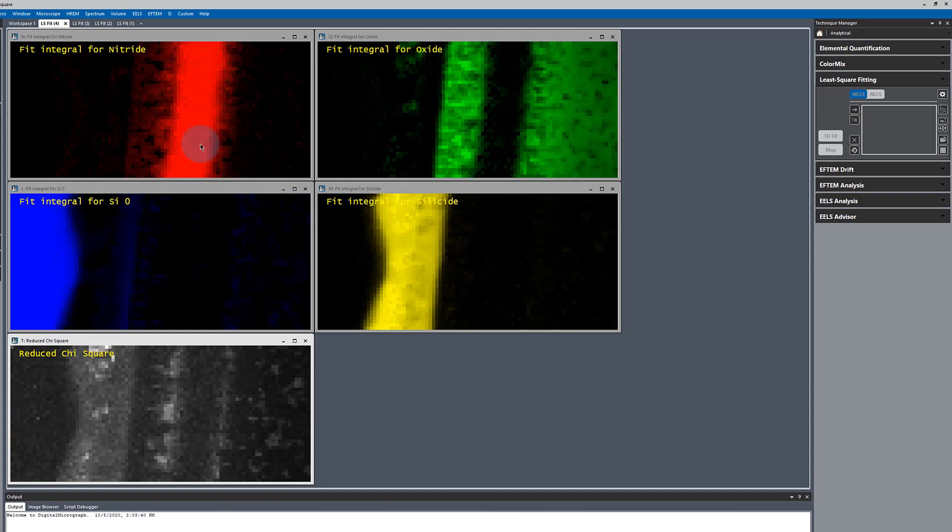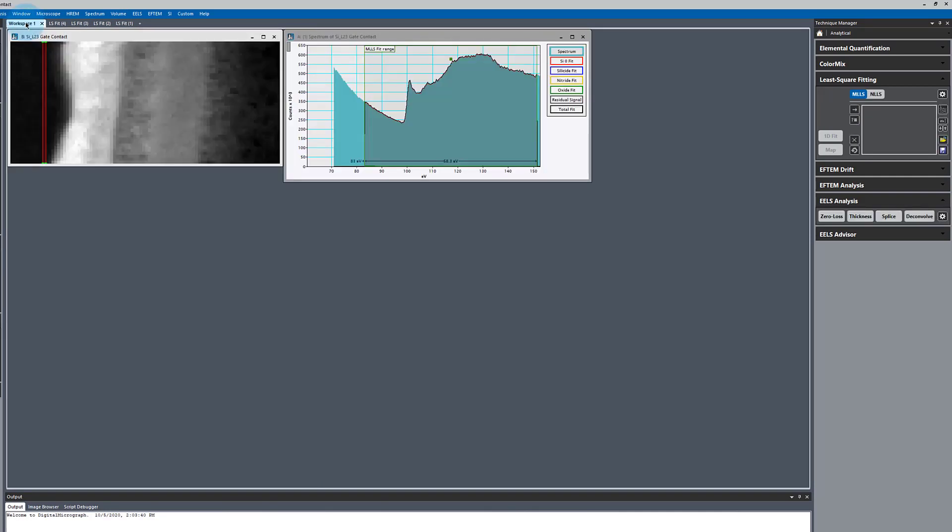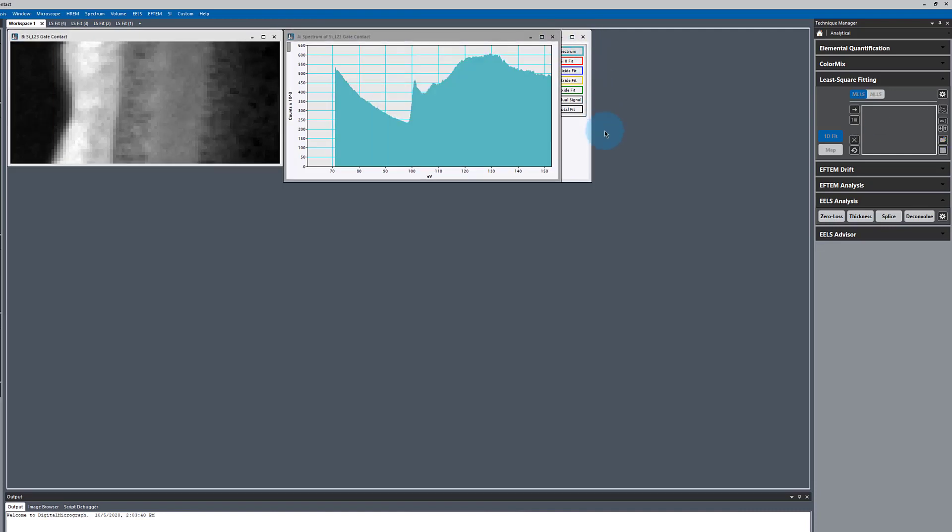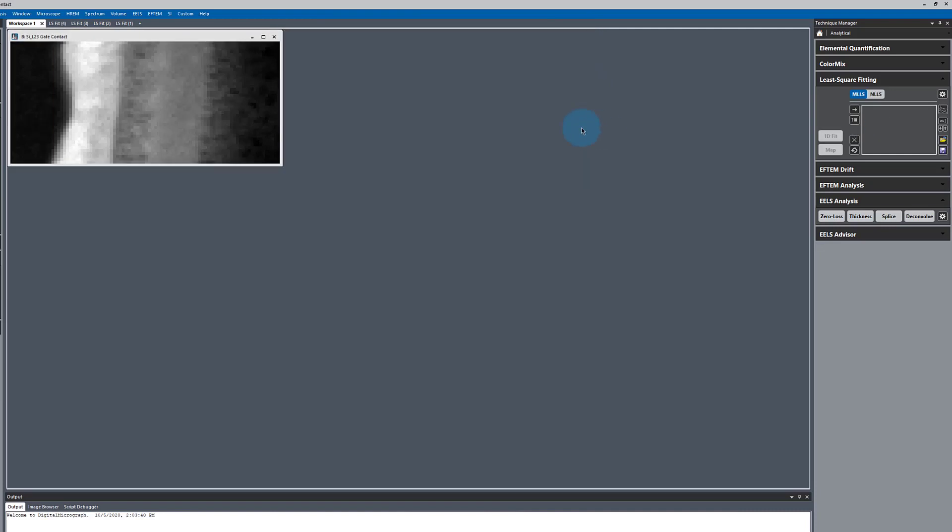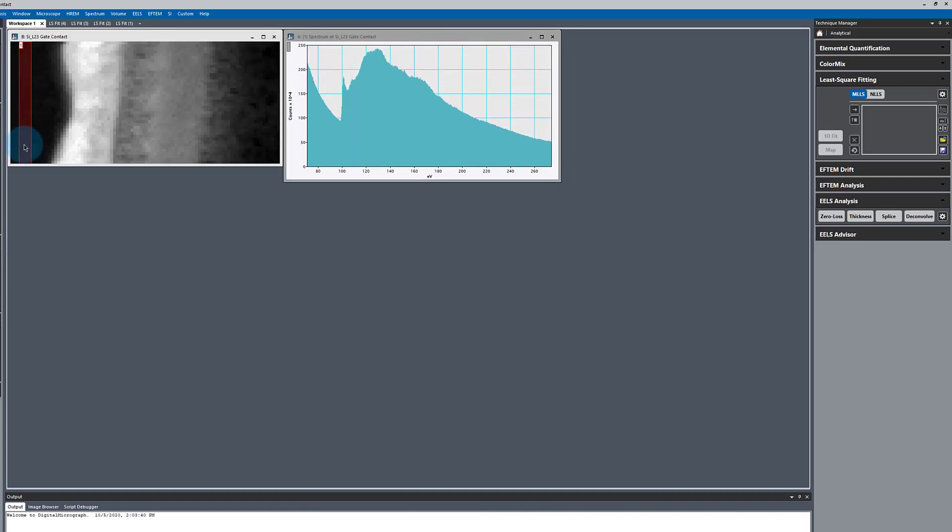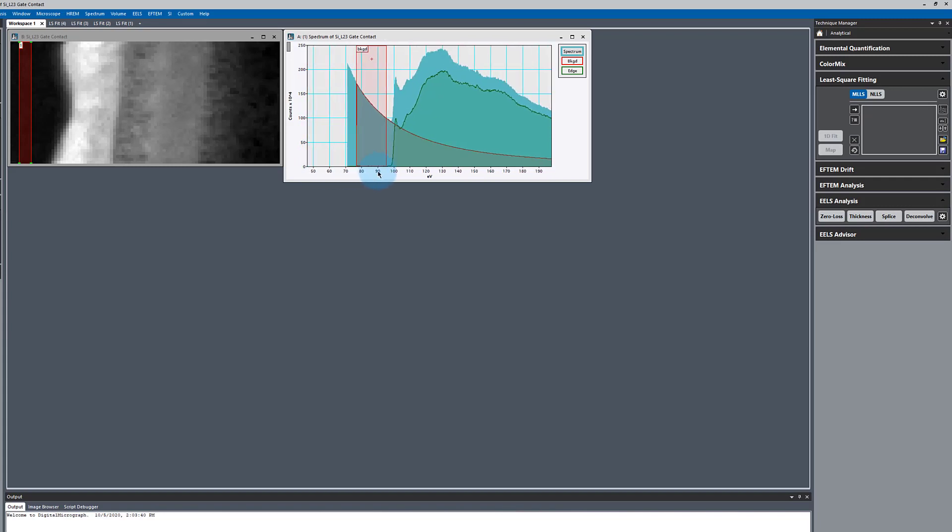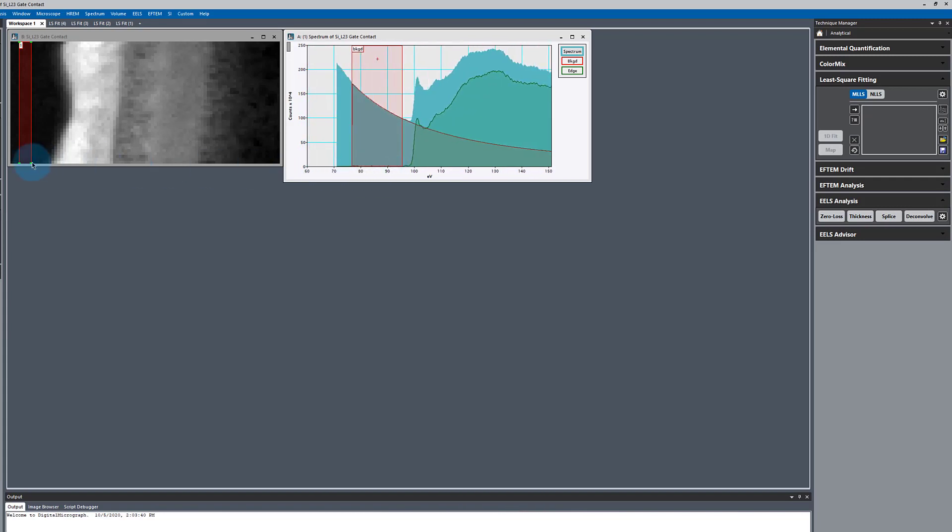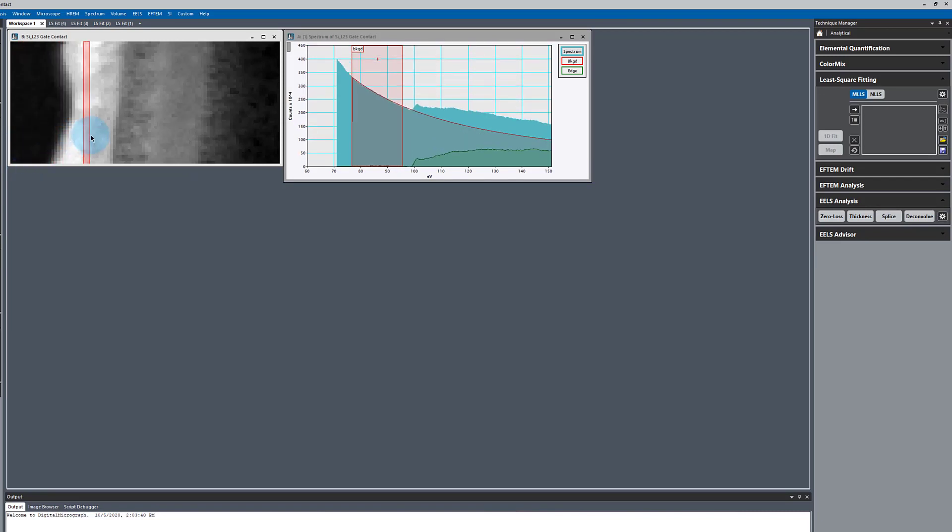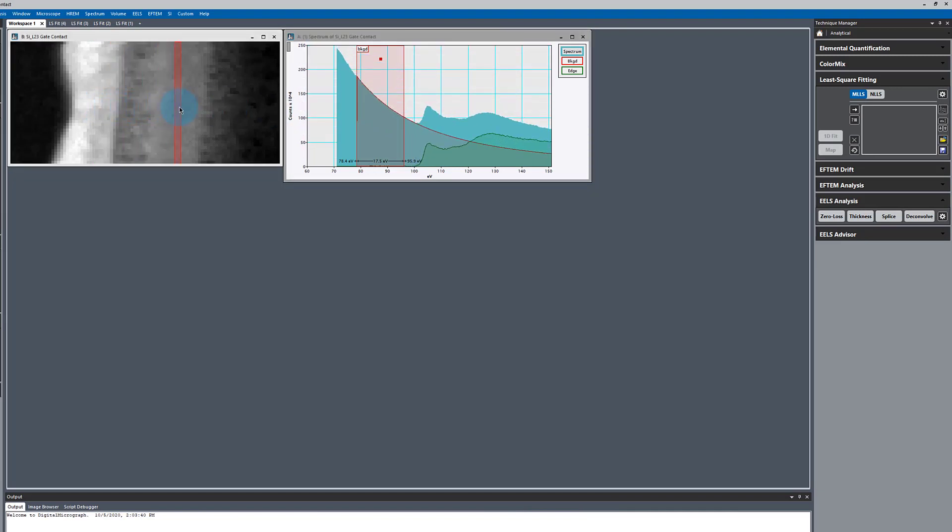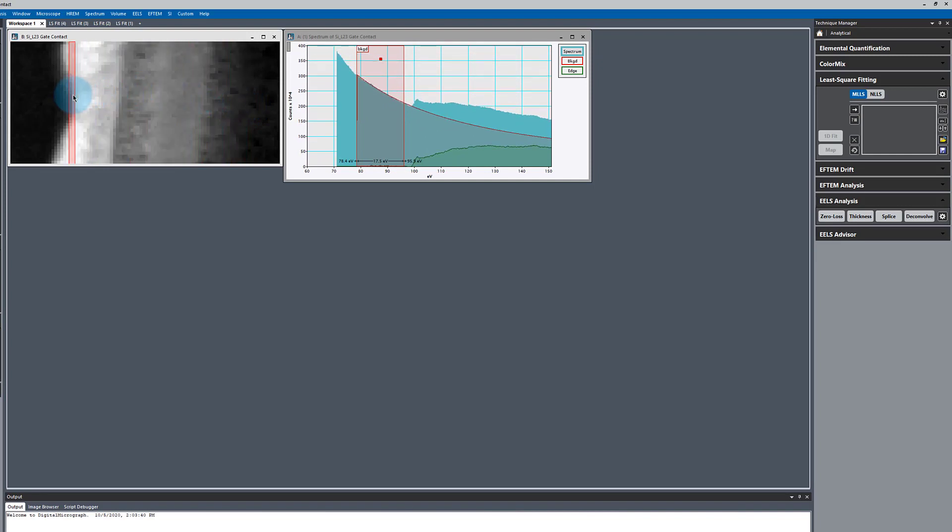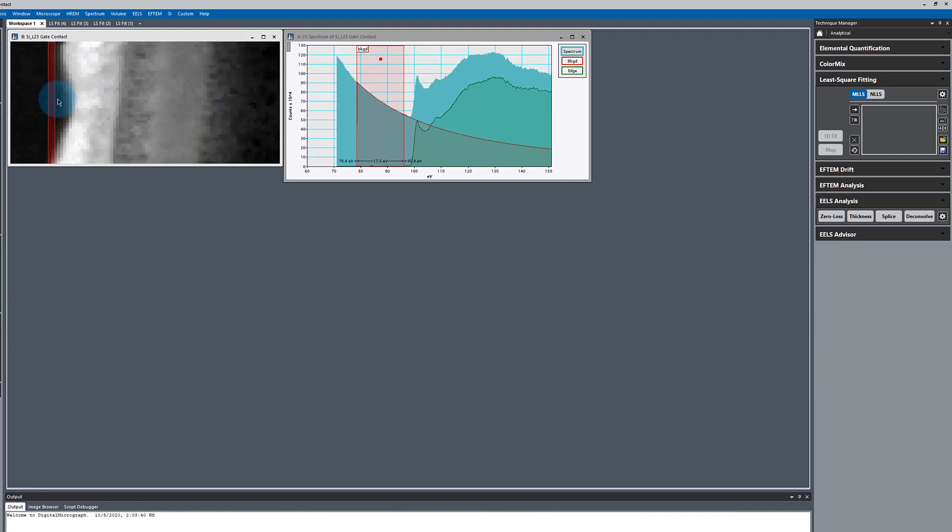Now our third approach for background fitting is a little bit different. I'm just going to close this out and start with a new picker tool. Here, we're going to fit the background. Make sure it fits reasonably in this area, make sure it fits reasonably in this area.